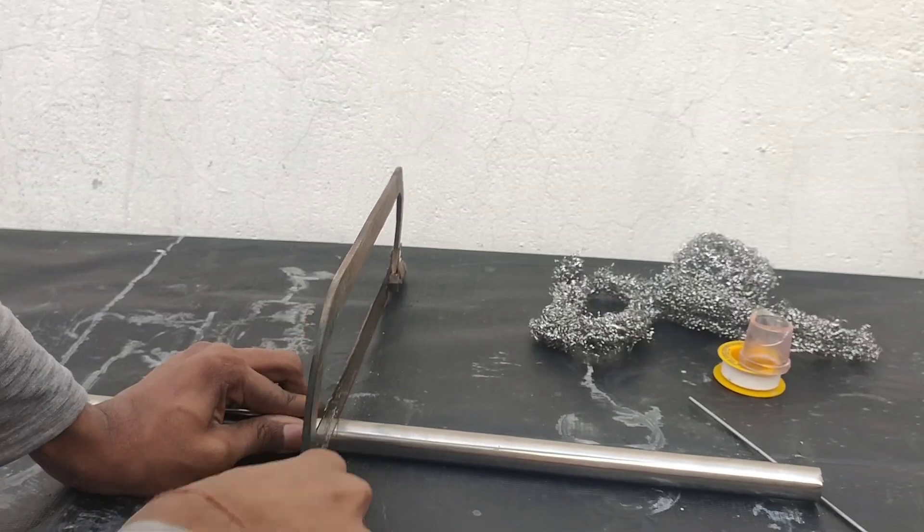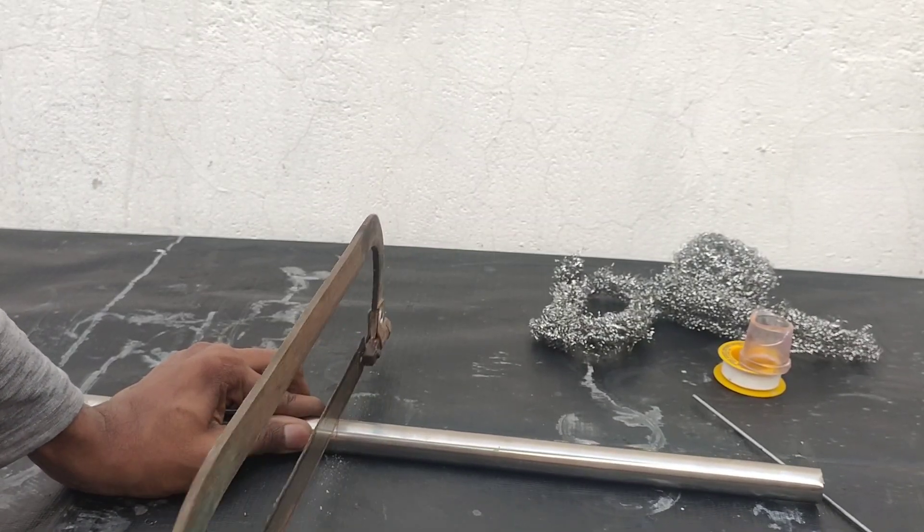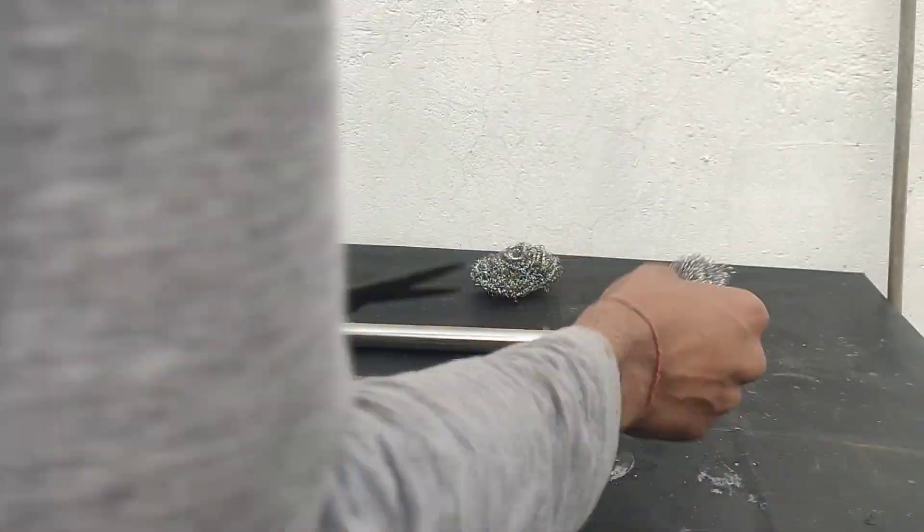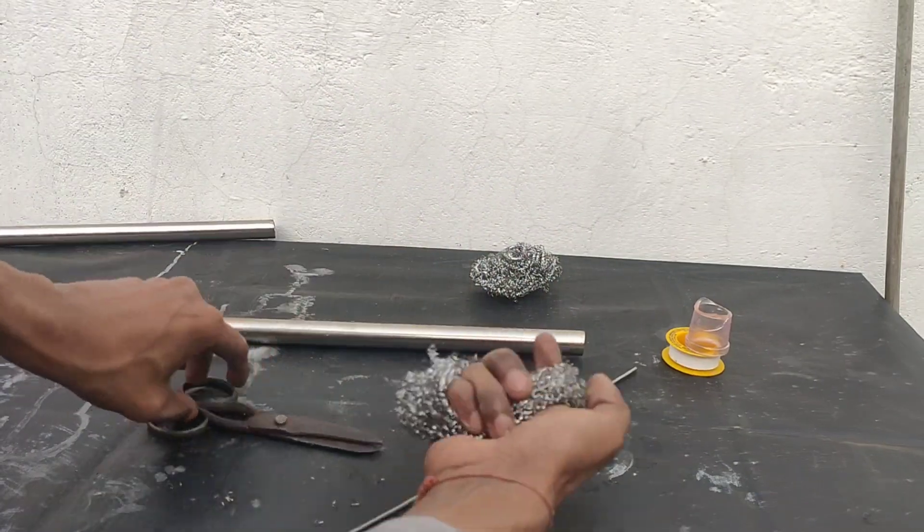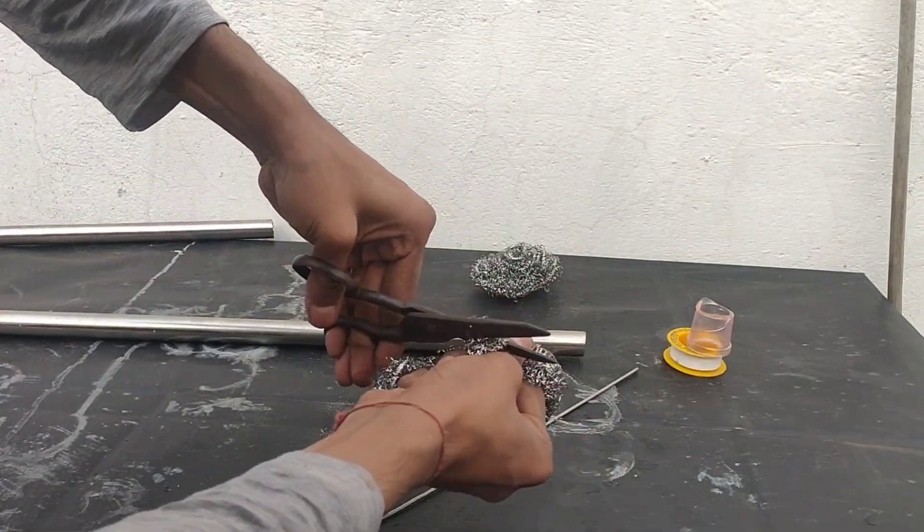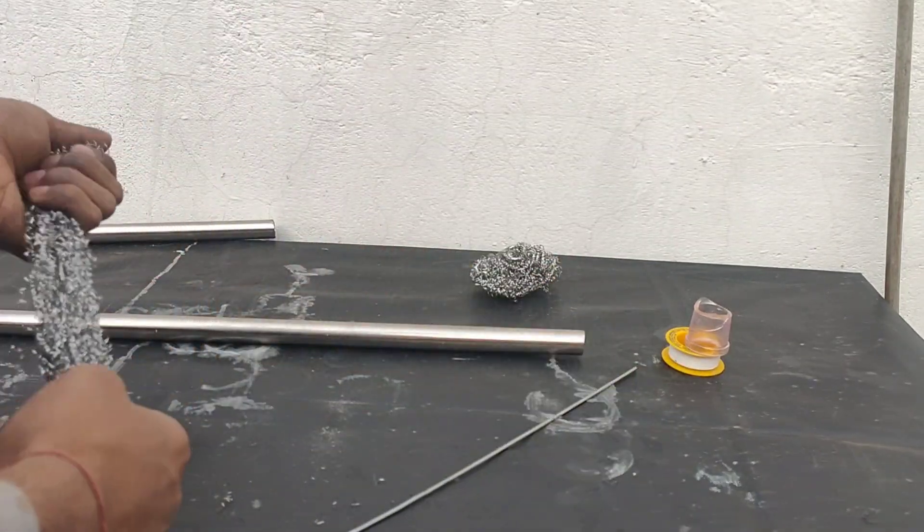First with the help of a hacksaw, I cut 45cm of the tube. To pack the steel wool, I stretched the scrubber like this and then cut it to open it. Now it can be fitted inside the tube.